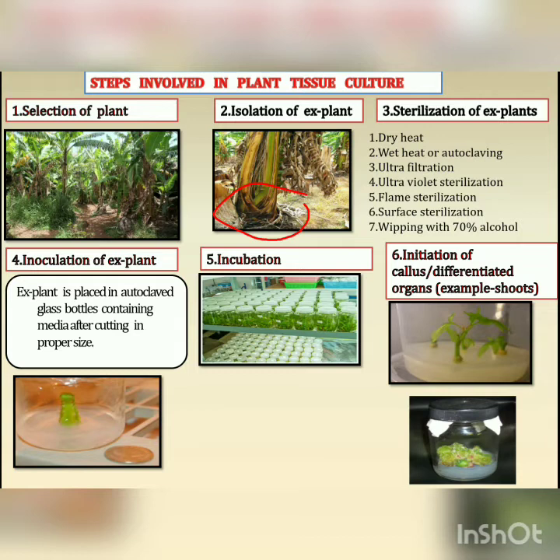Now this incubation image is of some other plant, not of the first stage of banana. I have just kept it for your information, to show how the bottles are kept in the growth room.